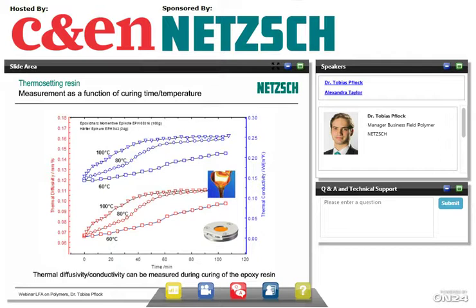Well, again, we see two properties here, and we measure the thermosetting resin as a function of curing time, in this case, and curing temperature. So I will take you through this graph. In red, again, we depict the thermal diffusivity, and in blue, we depict the calculated thermal conductivity. And you see thermal diffusivity increases with time. And if you take a closer look, we measured this whole procedure at 3 different temperatures.